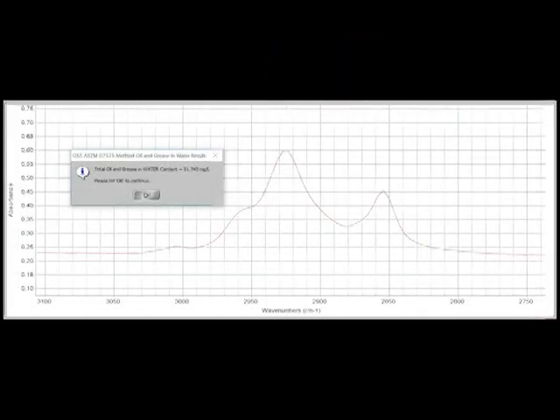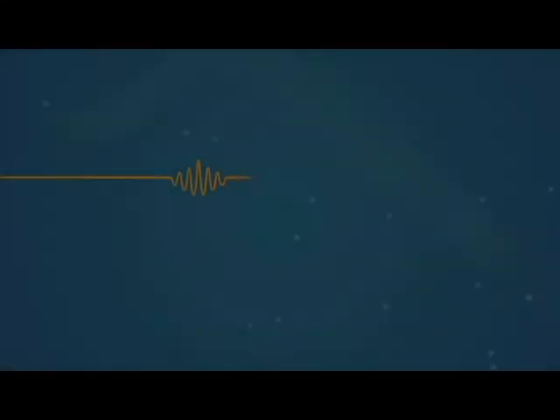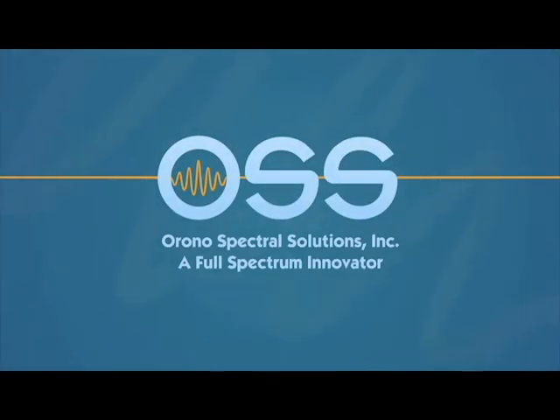No calculations necessary. Orono Spectral Solutions' ClearShot technology eliminates the drawbacks found in other methods by providing a low-cost, solvent-free, accurate, and green way to perform oil and grease analysis with a fast and scalable processing rate of several bottles per hour when analyzed in triplicate. To receive your quote for the complete oil and grease and water package, as well as OSS's other applications for the patented ClearShot and ClearSampler technologies, visit our website.